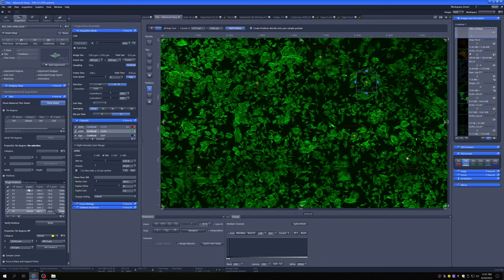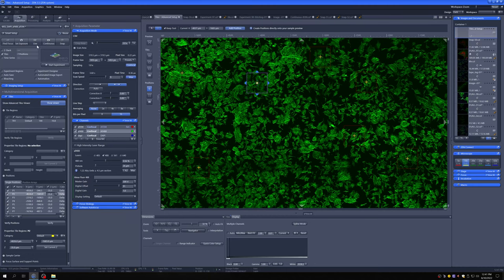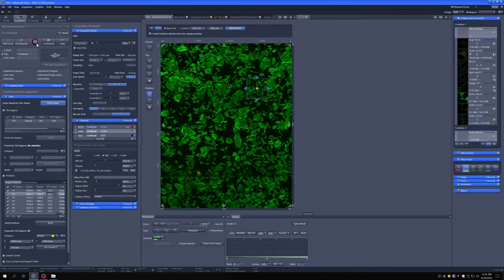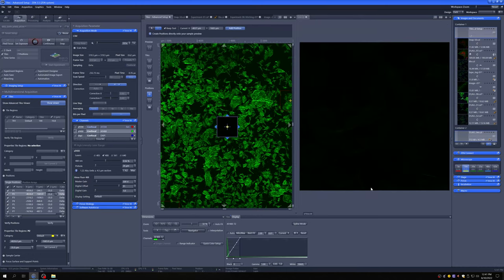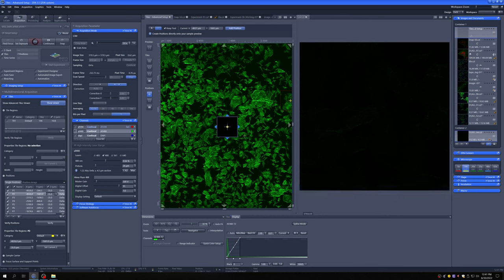So for example, if I now go to this one by double clicking on it, it goes there. If I go to live, I have this position.